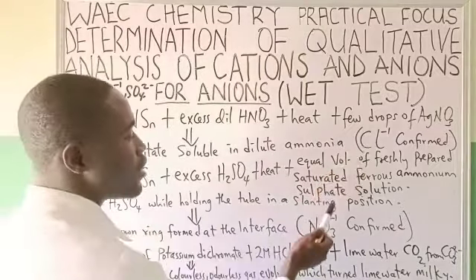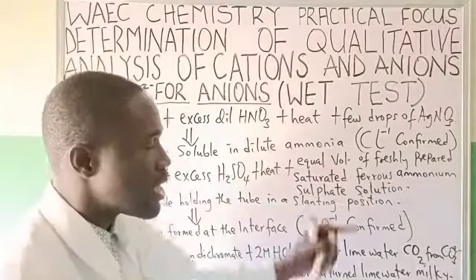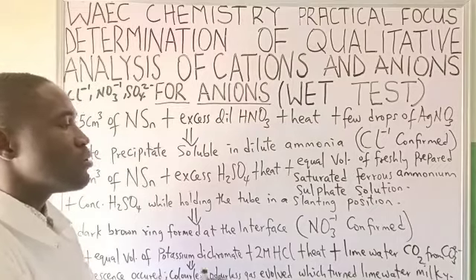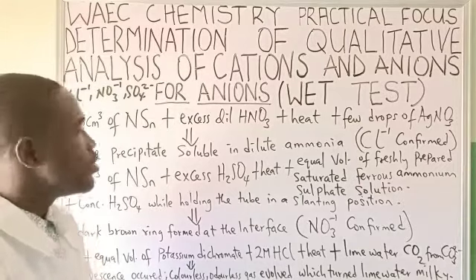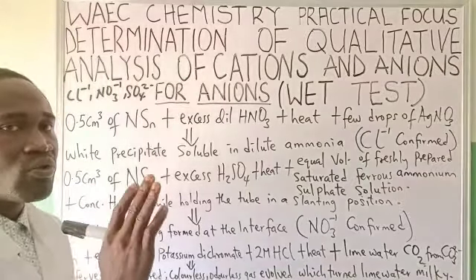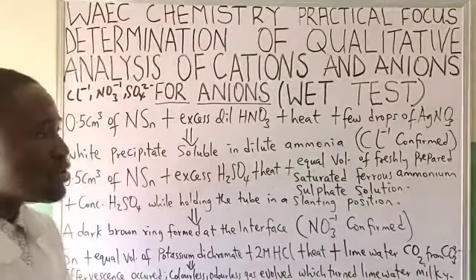All these anions, whether polyatomic or monoatomic, are called acid radicals. If we want to confirm them and we don't want interference of heavy metals, we prepare sodium carbonate extract so that it will get rid of those heavy metals, so that we will easily confirm them.